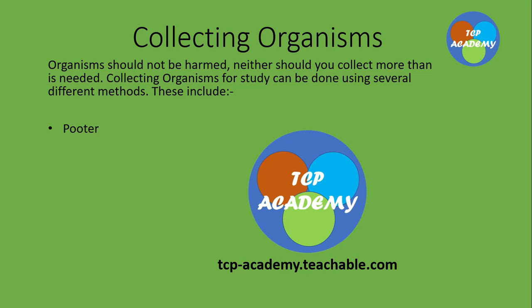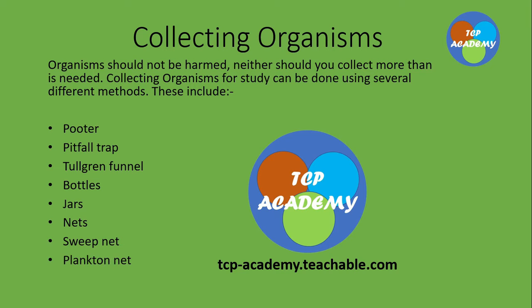So for this course, we're going to be looking at how to use a Pooter, look at pitfall traps, Tullgren funnel, bottles, jars, nets, sweep nets, plankton net. We're going to be focusing today, however, on the Pooter.